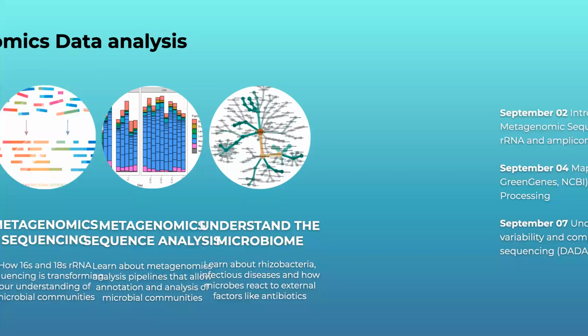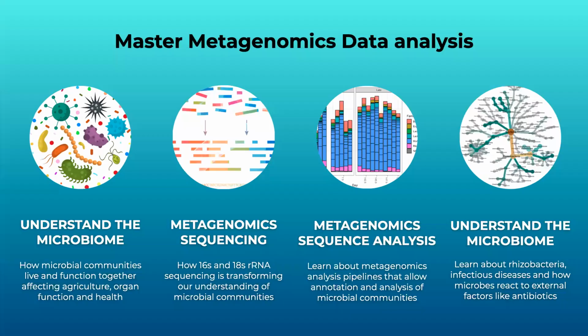So the objective of this program is to understand the microbiome, to understand metagenomic sequencing, to understand methods of metagenomic sequence analysis, and apply that to interpret the microbiome. So that will include some methods of analysis, visualization, and interpretation.